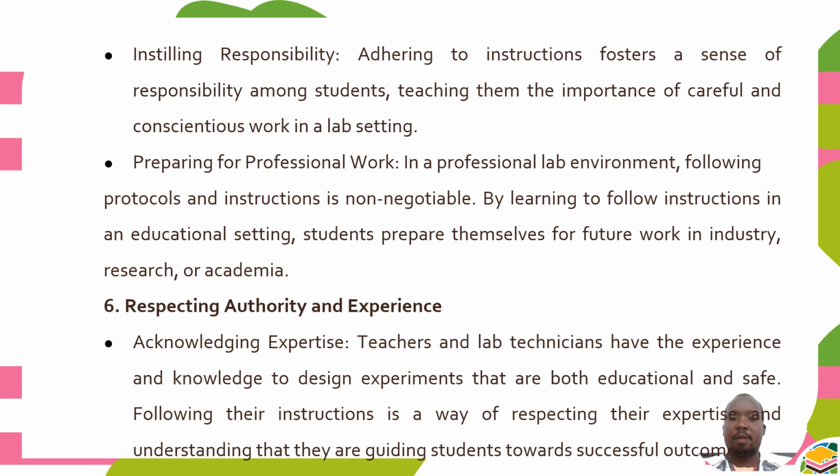Then following laboratory instructions also instills responsibility. Adhering to instructions fosters a sense of responsibility among students, teaching them the importance of careful and conscientious work in the lab setting. Preparing for professional work: in a professional lab environment, following protocols and instructions is non-negotiable. By learning to follow instructions in an education setting, students prepare themselves for future work in industry, research, or academia.